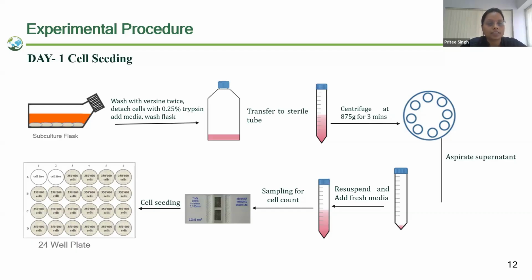The concentration of trypsin was maintained at 0.25%. And to stop the activity, after a few seconds of trypsinization, media was added, that is L15 culture media, to stop the activity of trypsin. Then this material has been transferred into a centrifuge tube, and after centrifuge, in the pellet, fresh medium is added, and manual cell count has been performed with the use of hemocytometer and microscope. So 350,000 cells have been added in each well in the 24 well plate, except the first two.